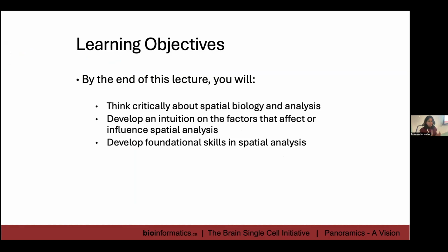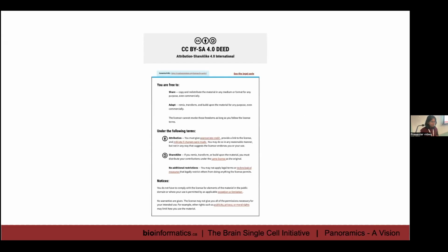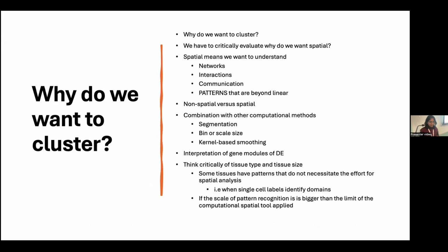I think everyone will form their opinion and compendium of favorite spatial tools. There's no right or wrong answer. It really is understanding what is going on in the background. And you all know your projects better than anybody else. I think this should have gone before the learning objectives, but never mind.